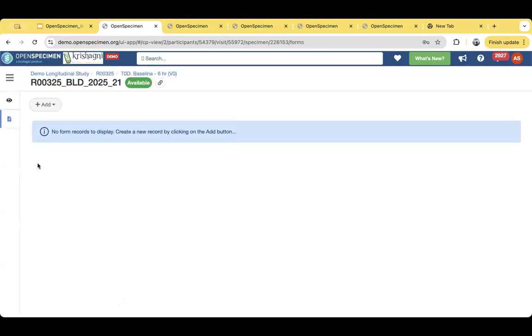And this is one of the powers of OpenSpecimen, where not only can you create these forms, you can create them at different levels, like patient, visit, specimen. You can create it at a specific study level. You can say that a cancer study would have different form data collection needs, versus a COVID form would have different data collection needs, etc.